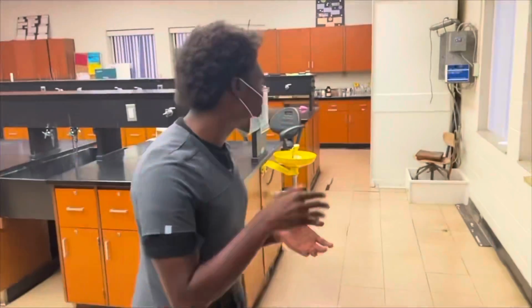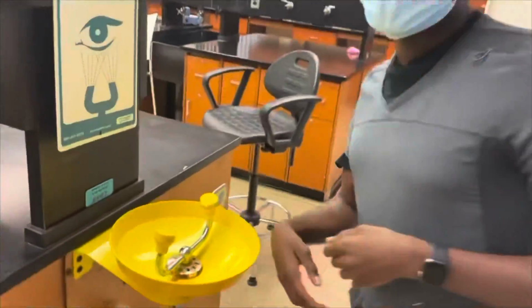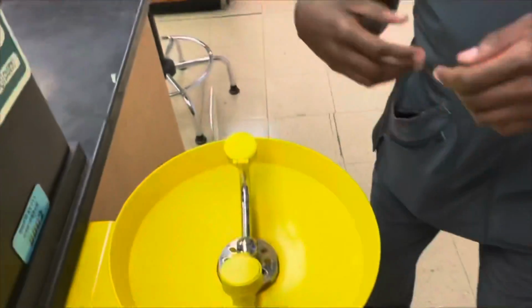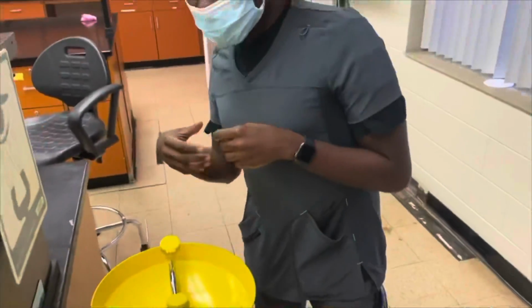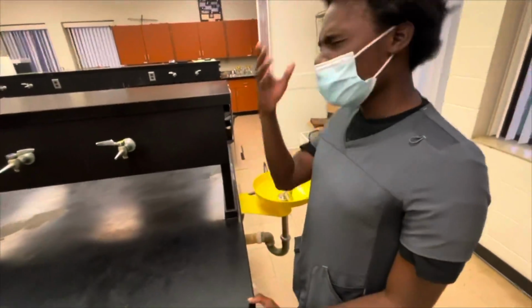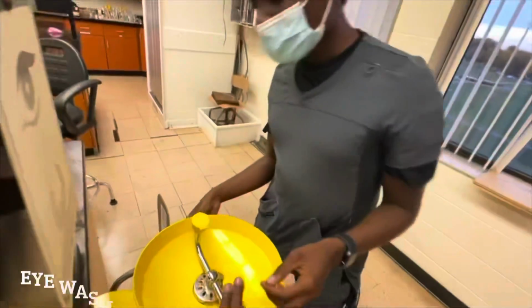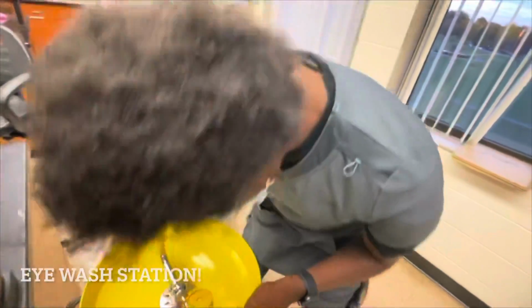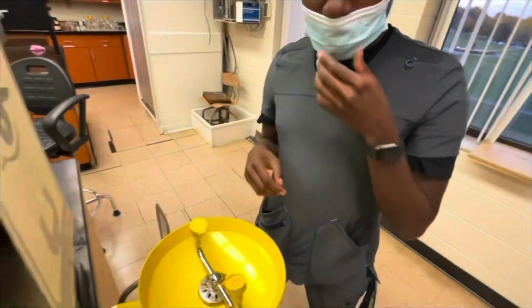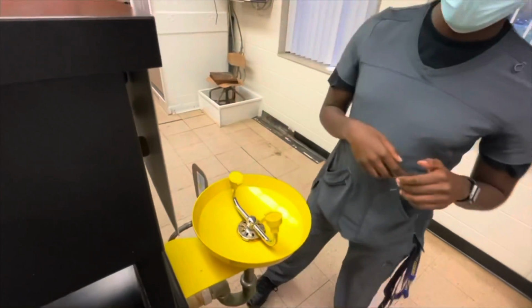Ooh, okay. So look, now come over here. I want y'all to see this station real quick. Here, DJ is showing what would happen if you entered the lab and did not wear goggles. Y'all have this substance right here, and it pops in your eye, and you're over here crying and stuff. This is where you want to come to the eye station. You want to turn this on real quick while your eyes, and then whoa, I don't want that on right now, but you just want to go like this, try to open your eyes and get it out of your eye, okay? Over here, already been used.